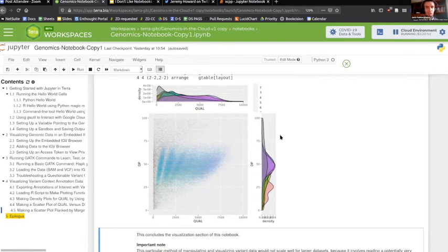So you can get quite far from loading the data into running GATK to visualizing, all within one environment. And this is good, as the book points out, for debugging if something goes wrong, or if you want to run on a moderate amount of data and just get a feel for how things work and then scale up.